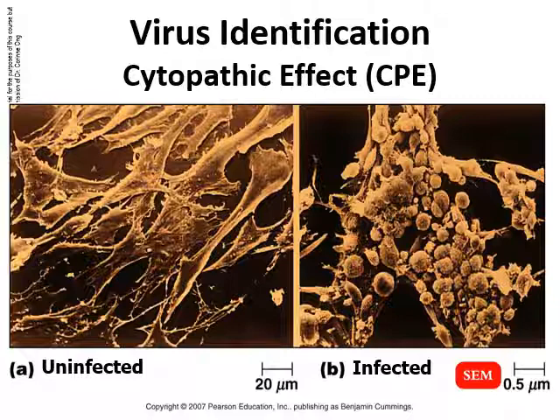When a cytopathic effect is observed, cells curl up in round balls and bunch together. Usually, they'll die and lyse, so large holes can be seen in the cell monolayers when viruses are present.